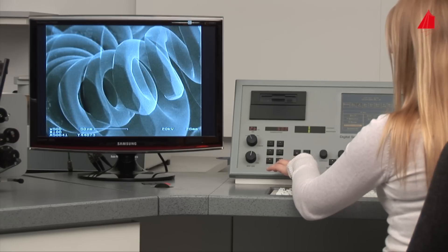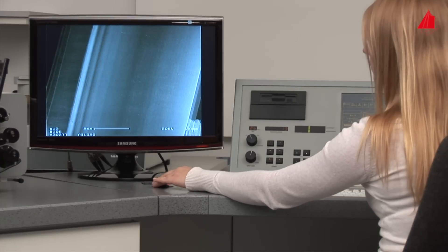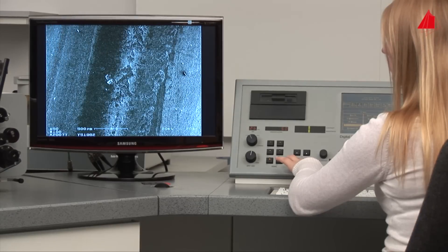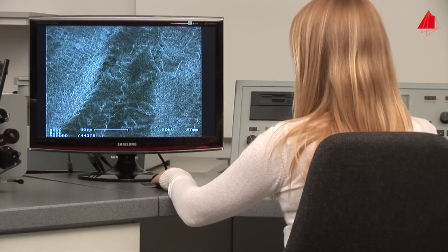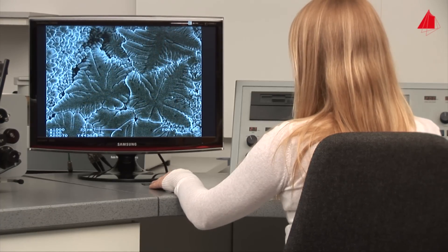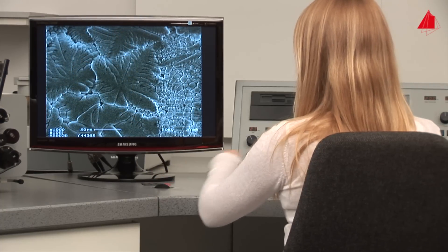Back in reality, the material tester selects low magnification again and looks for the second sample — an austenitic stainless steel tube with a longitudinal weld, invisible to the naked eye. The scanning electron microscope reveals fantastic crystals that have grown near the surface during solidification of the weld deposit. In some crystal directions the solidification rate is particularly high, and so-called dendrites form. Dendrites are crystals with many branches and a tree-like shape; on the surface of the weld they could grow almost freely and can now be observed well.